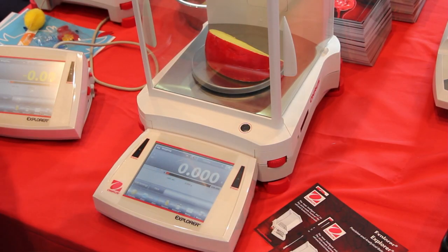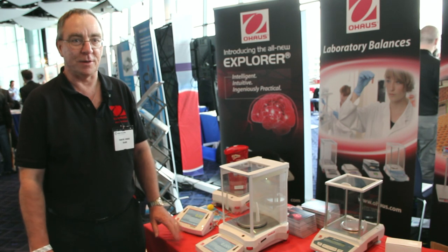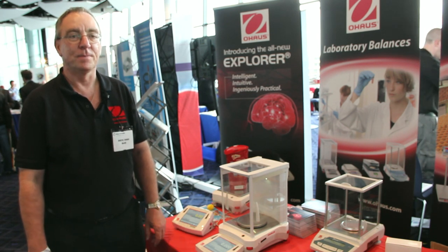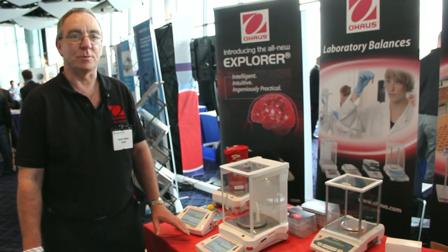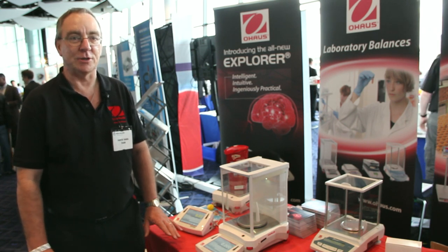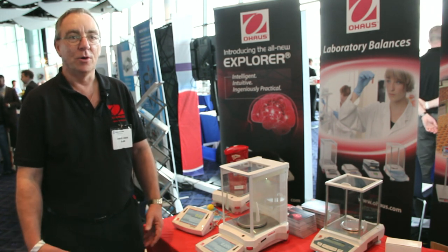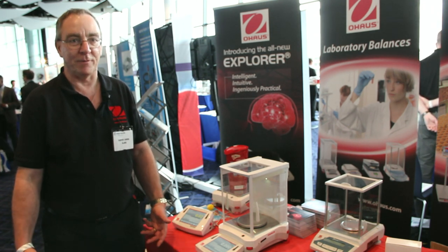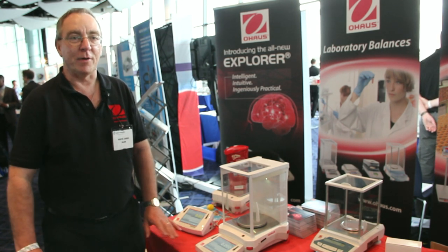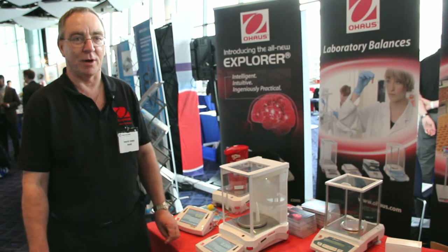That includes tear, zero, print, and a combination of a total of 32 different operations that you can set up. The balance comes as standard with internal calibration, so every model has its own calibration system built in, which can be done on demand or timed based on environmental changes, making it a very functional, very accurate top-of-the-range balance from the O-House range.